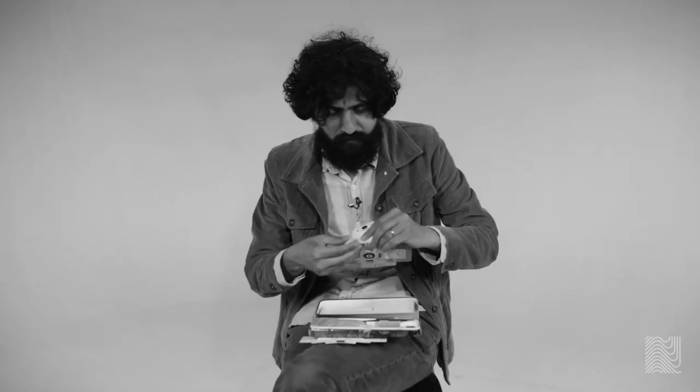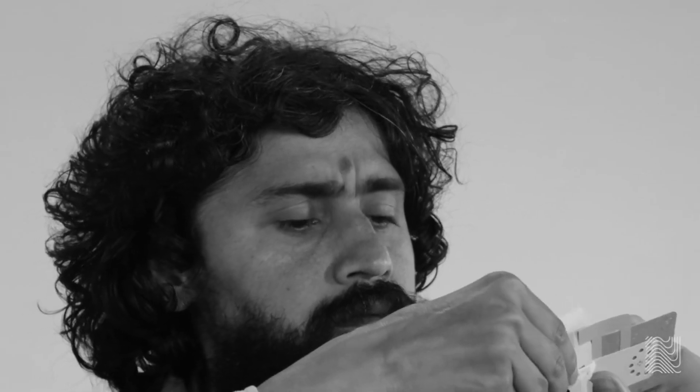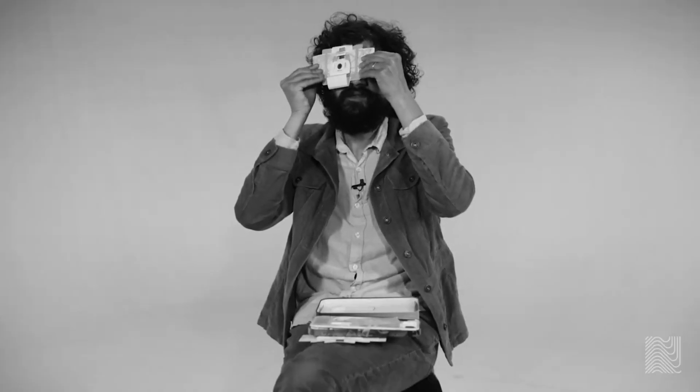'Foldscope is a microscope that we came up with that's built via origami. You fold it yourself with your own hands, and within 15 to 20 minutes you have a fully functional microscope. A very simple goal that we have with the tools we make is: if we can just make this world a more curious place, that would be enough.'